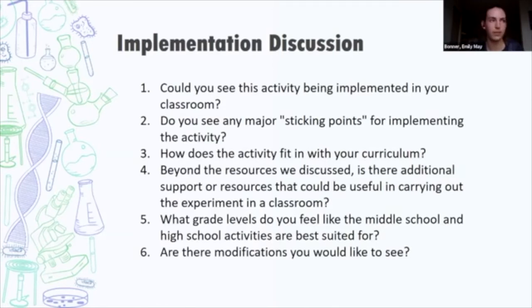Yvonne, do you have any comments on that? Yeah, I know in the videos that we created, we have some pictures of germinated seeds, and the way we defined it was essentially whenever you can see that white new shoot coming out.